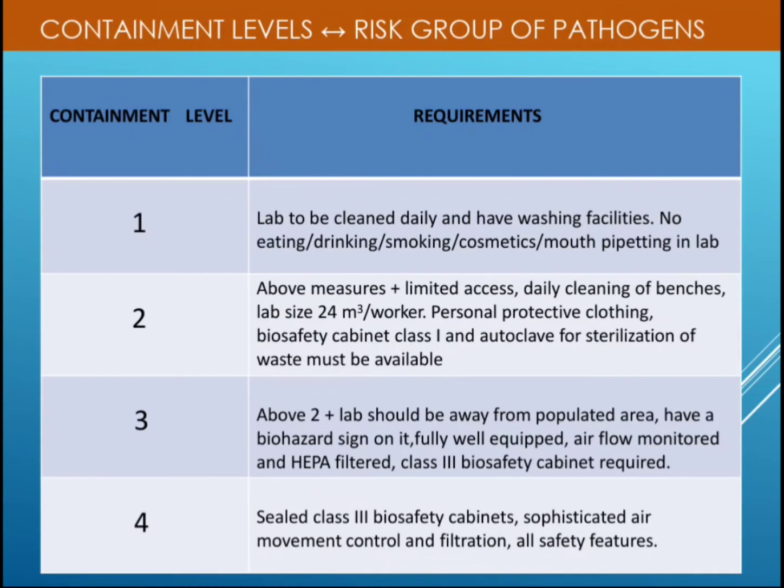Then the third containment level includes containment levels 1 and 2. In levels 1 and 2, what are the requirements? Plus the lab should be away from populated areas and should have a biohazard sign on it. Then it should be fully well equipped. Airflow should be monitored and HEPA filtered. Okay, a class 3 biosafety cabinet is required over here.